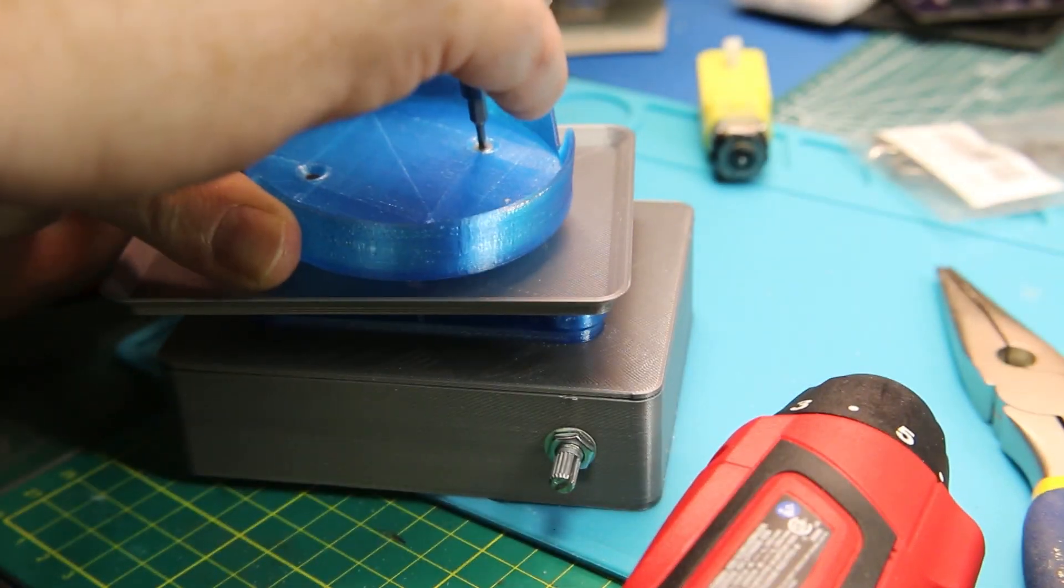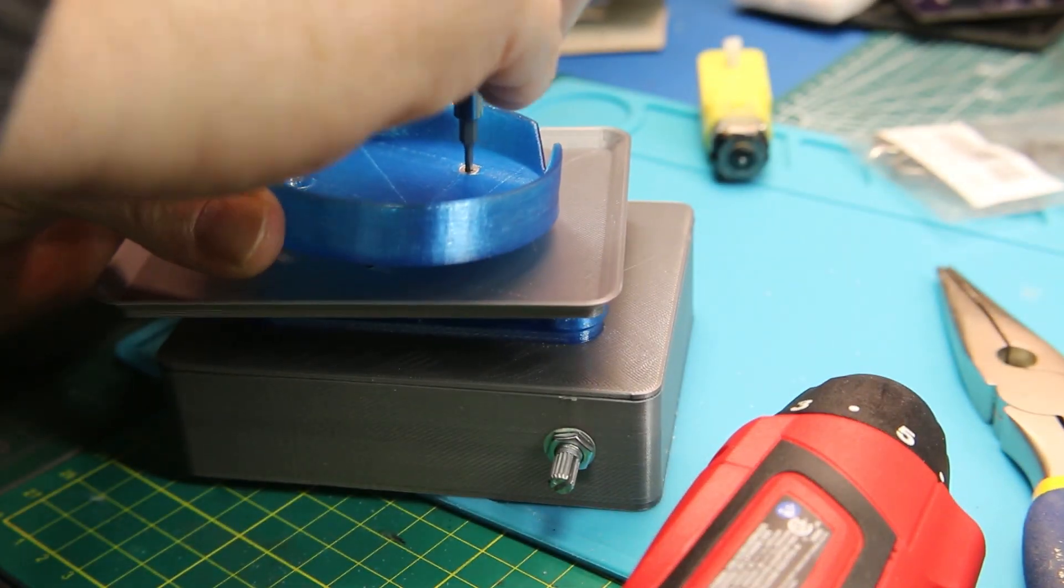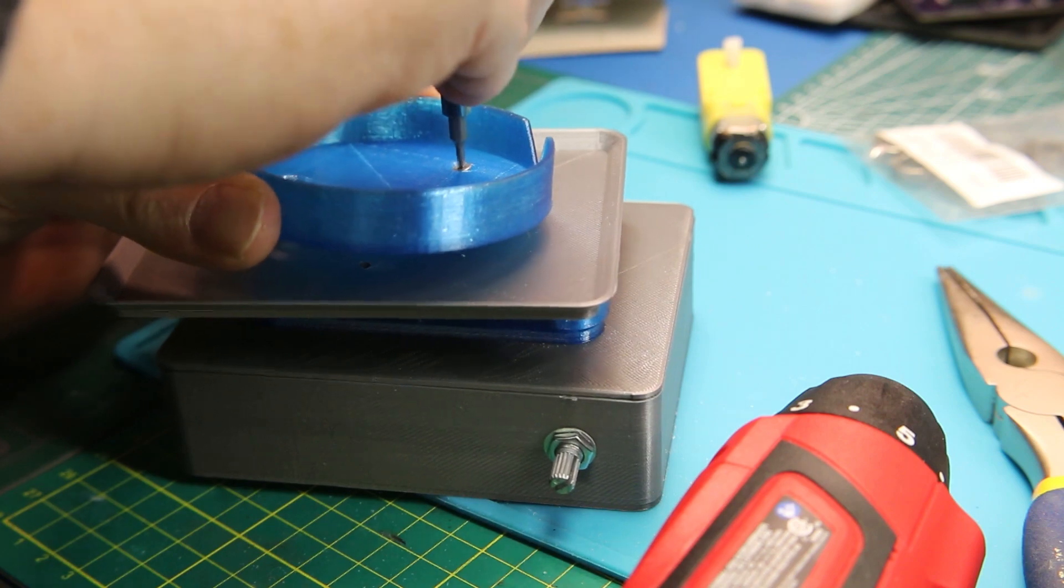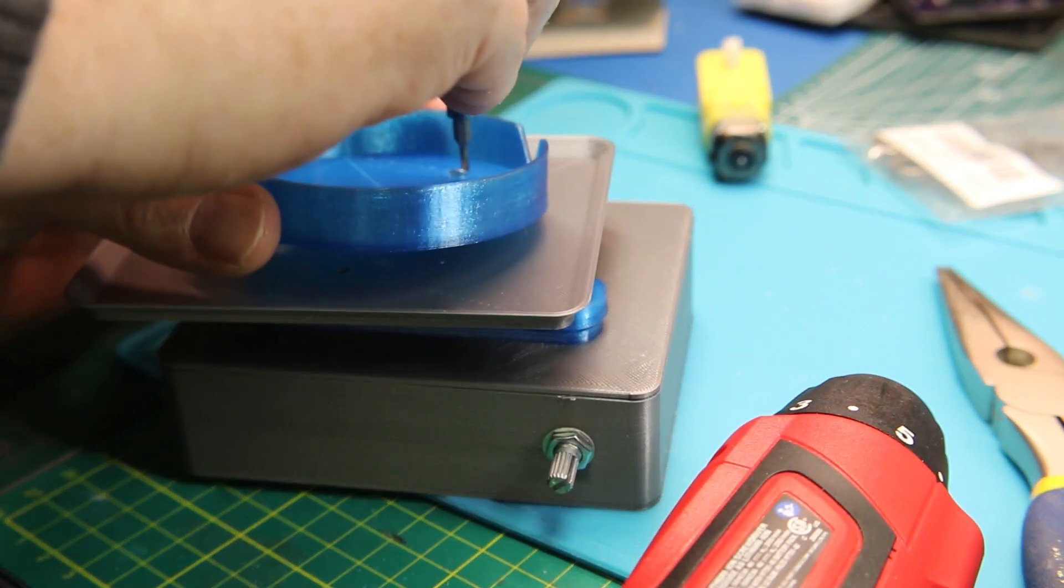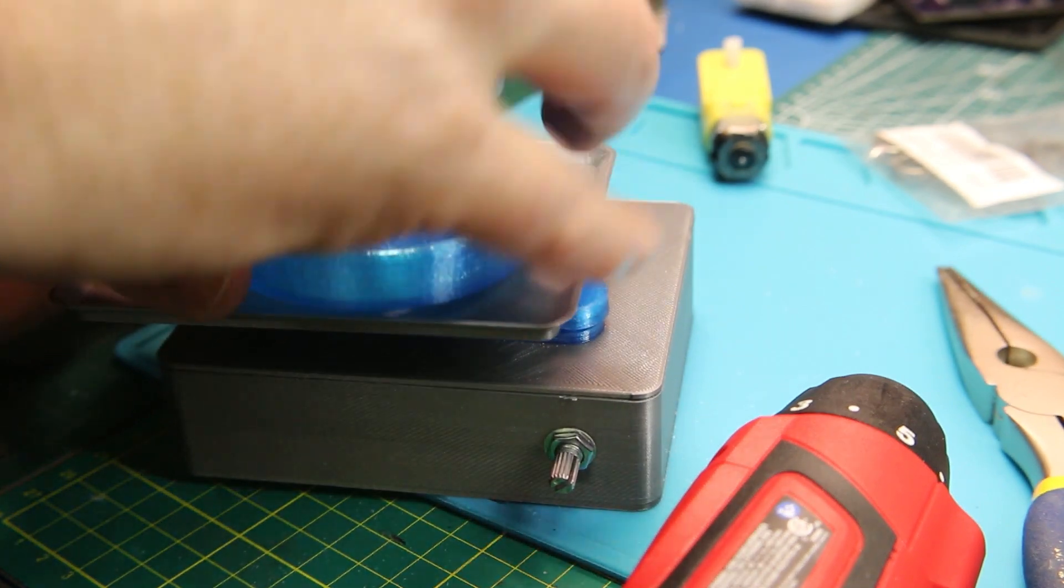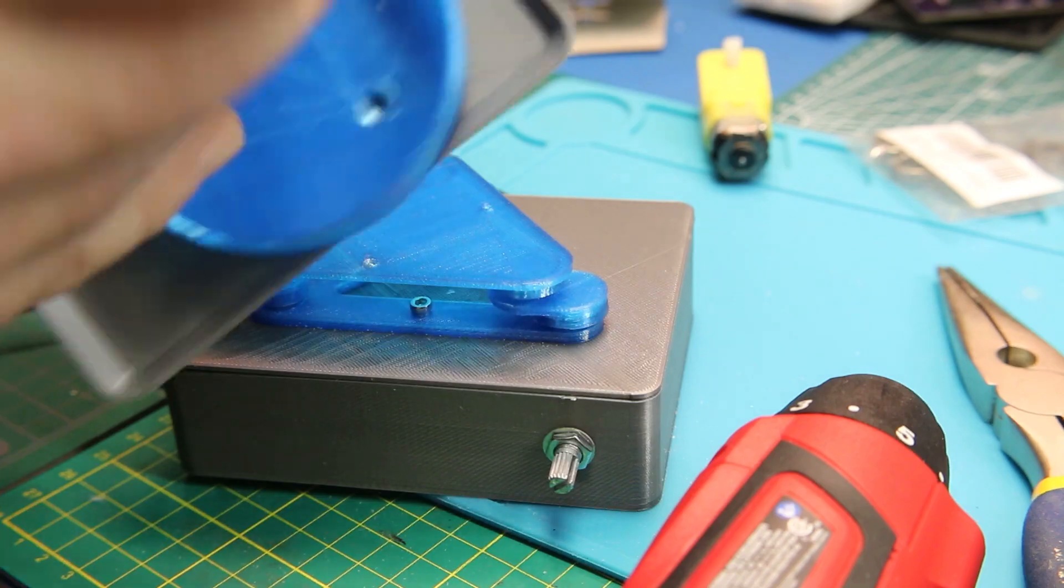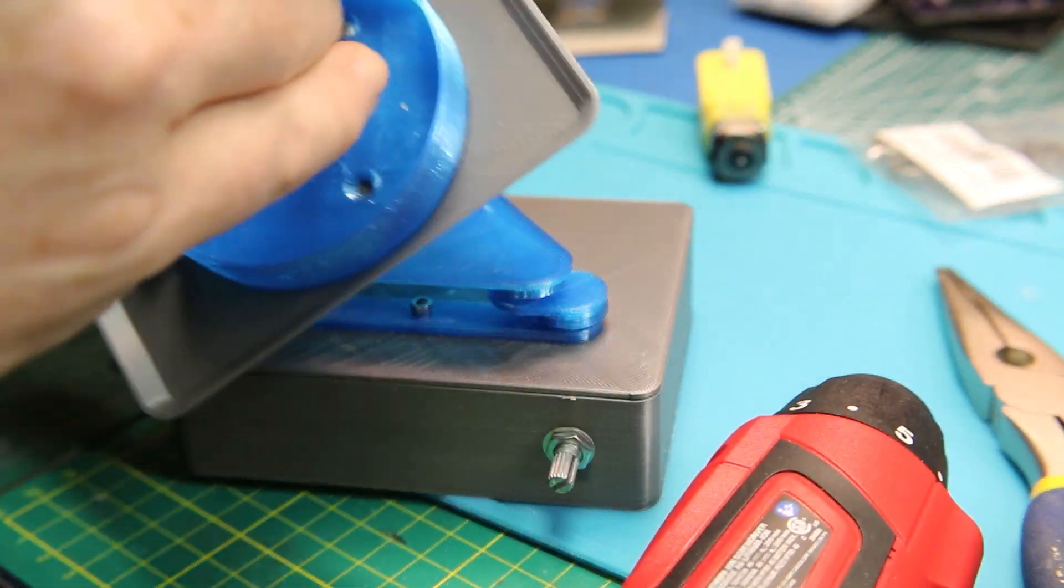So I went ahead and put this into place as well. It doesn't fit my jars terribly well, but I can make my own now by scaling this.